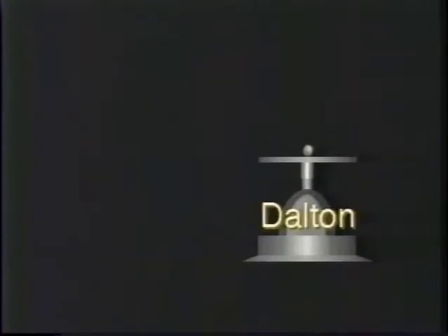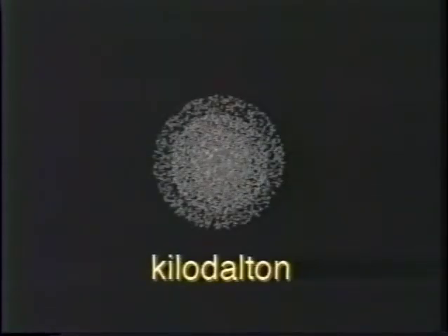To visualize just how big these macromolecules are, consider a molecule of water. An atom of oxygen bonded with two atoms of hydrogen. One hydrogen atom has a mass of 1 Dalton. The smallest macromolecule that can be imaged by gel electrophoresis has a mass of about 1,000 Daltons, or 1 kilodalton.